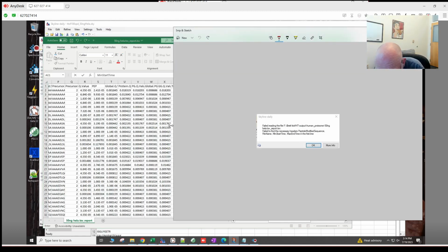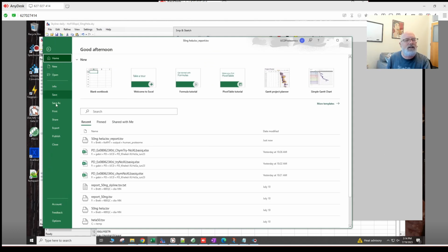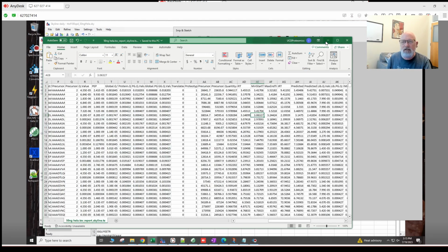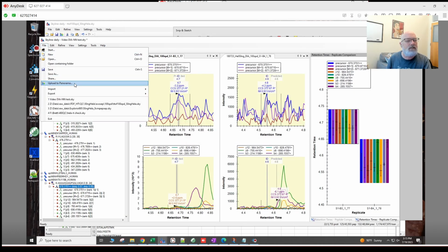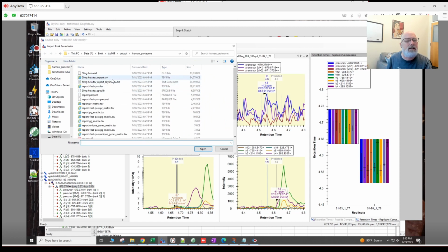And then max end time. Max end time. End time, spelled correctly. Okay, let's try that. And we're going to save that as a new file. This may or may not work. And we'll put it as for Skyline. Okay, let's try that. All right, we're going to close it or else it'll complain again. And then we go, okay, file, import, peak boundaries, and then select the file for Skyline.